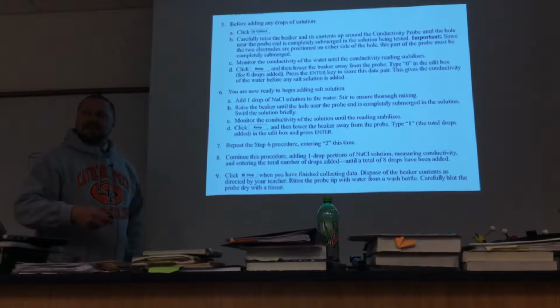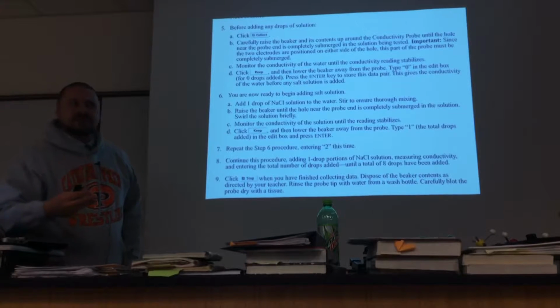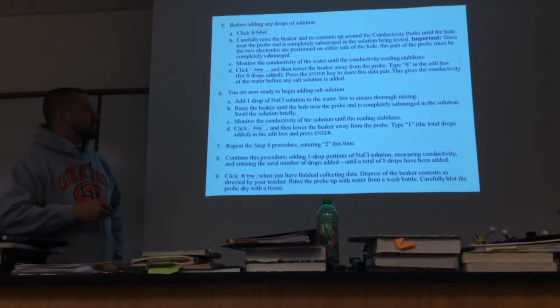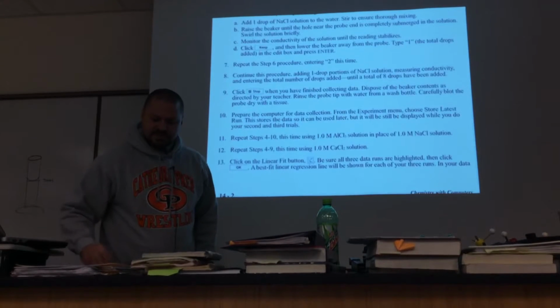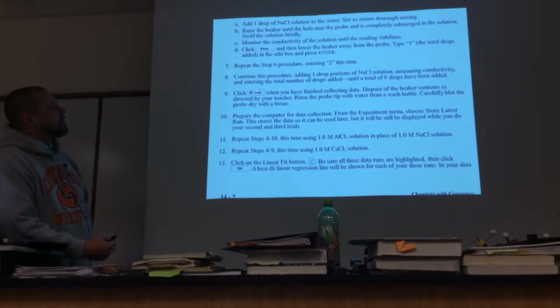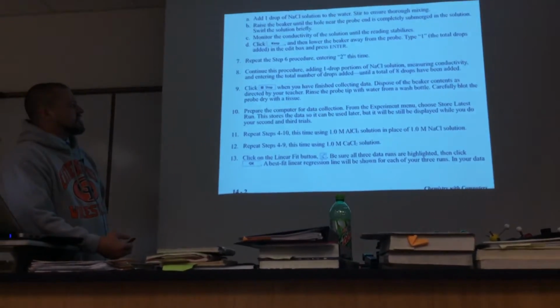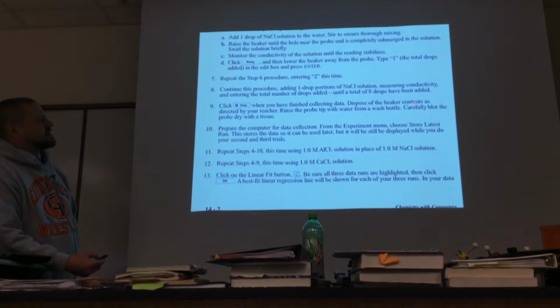And then you're going to add another drop. Do the same thing again. And then you're going to tell it I added 2 drops, and then 3 drops, and then 4 drops. You go all the way up to 8. Okay, so you go eventually until you get to 8. Once you get to 8 drops, it tells you to press stop. Now here's the very crucial step. Of course, you got to just dump this stuff down the sink.